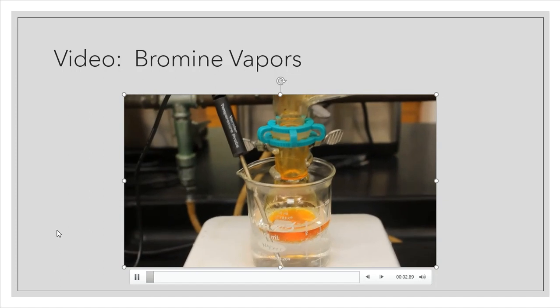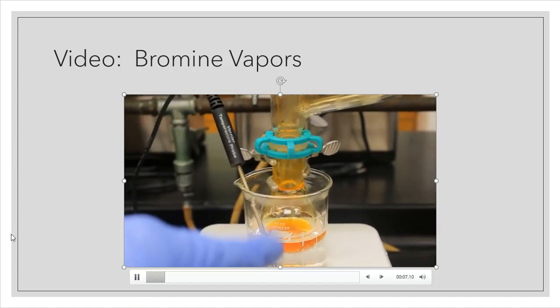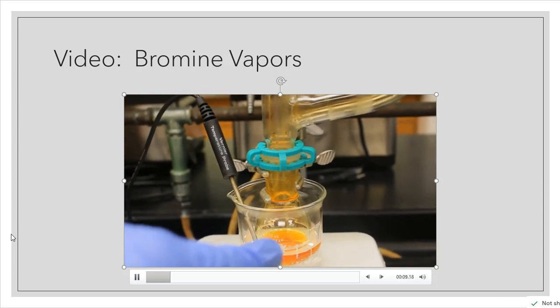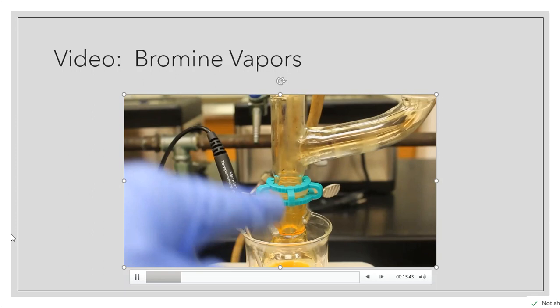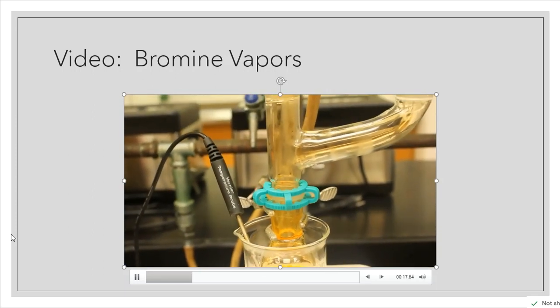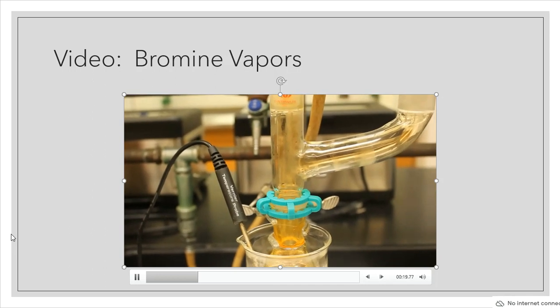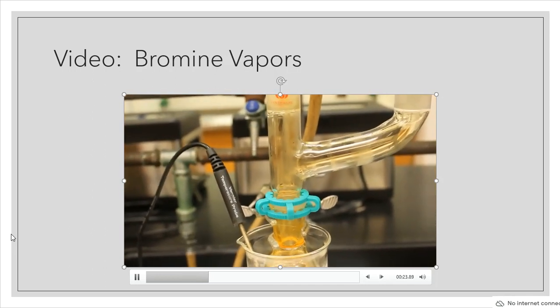So something that I want to show you is the purpose of the Claisen condenser and the reflux. Here's my transcinnamic acid with the bromine. Right up above the solution, though, you see this orangey layer. That's all of my bromine that's really escaping the solution and trying to make its way out of those flasks and into my lab. And I don't want those vapors to escape.